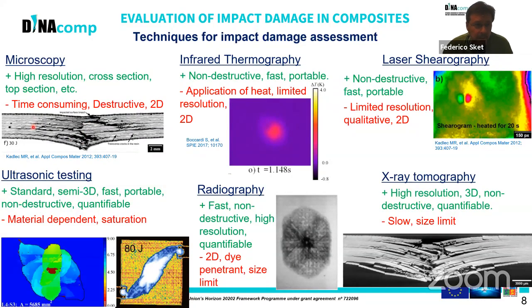So you have to cut the material, polish it, and then take some pictures, and you will see the damage in the interior of the specimen.